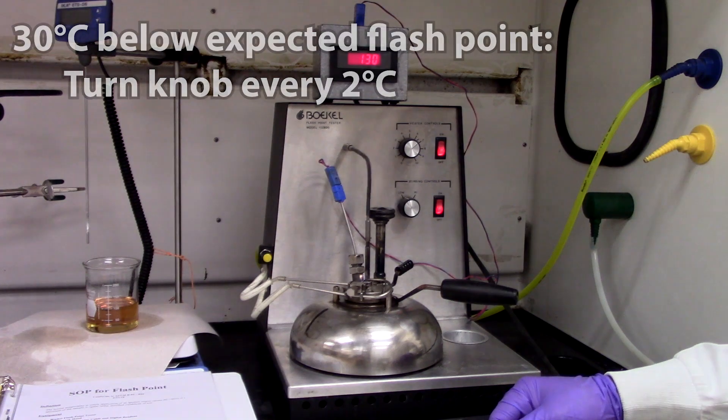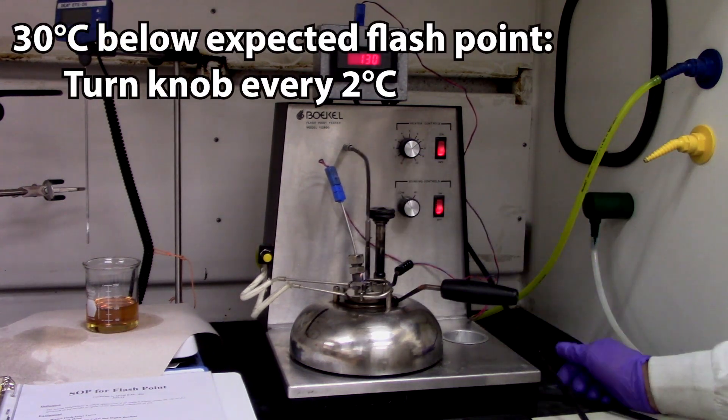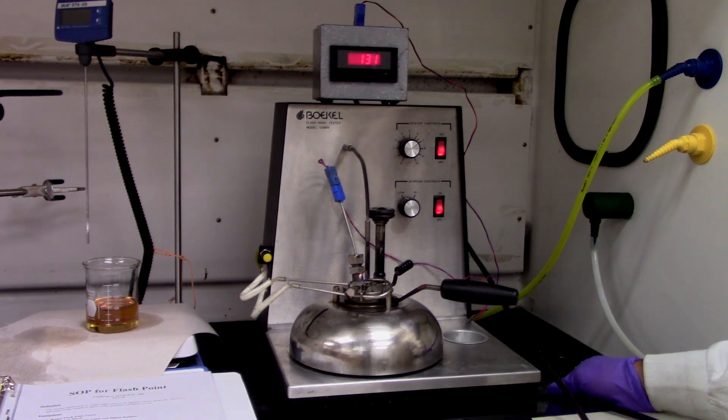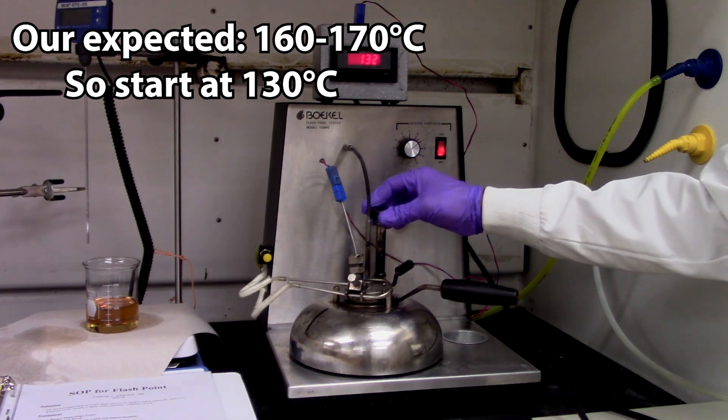Once the temperature reaches 30 degrees Celsius below the expected flashpoint, start turning the black knob clockwise every 2 degrees Celsius. For instance, our fuel typically reaches a flashpoint of 160 to 170 degrees Celsius, so we will start turning the knob at 130 degrees Celsius.